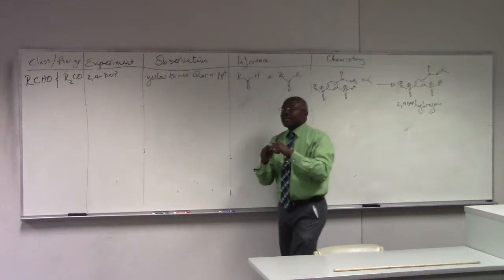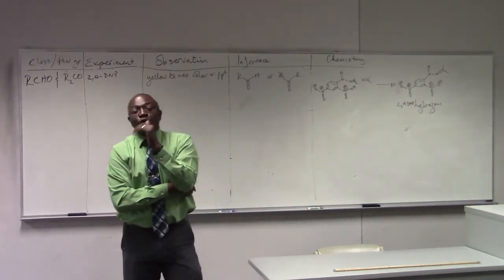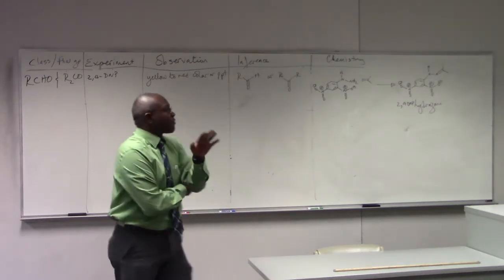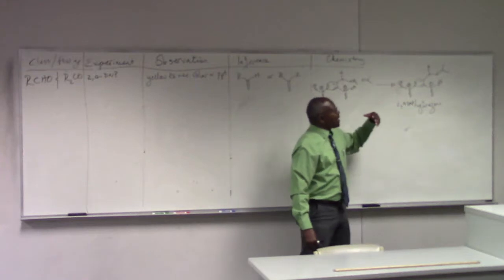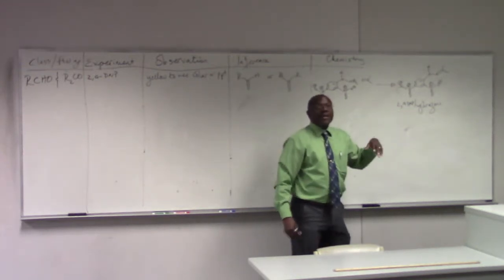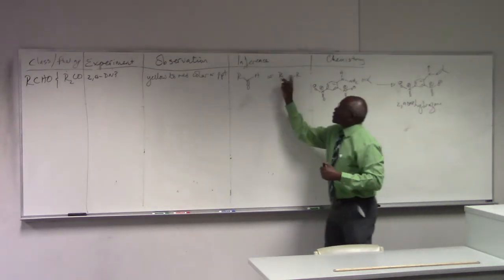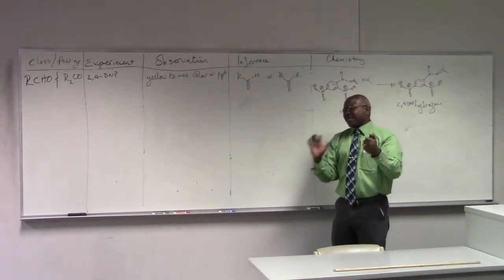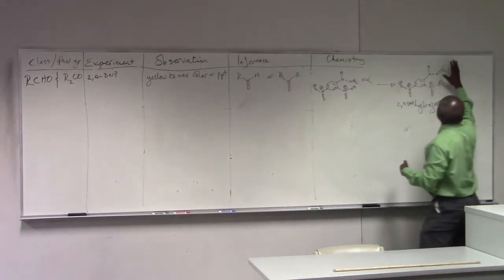The substance can either be soluble in the matrix, in which case it dissolves and you just see a yellow to red color. That would happen if the carbonyl compound is small. So typically 6, 7 carbons in all would make this compound soluble.